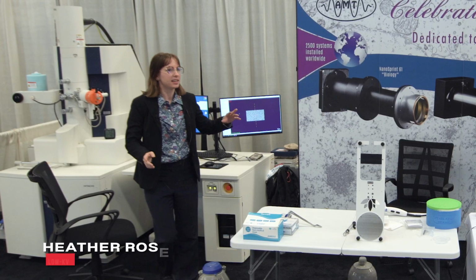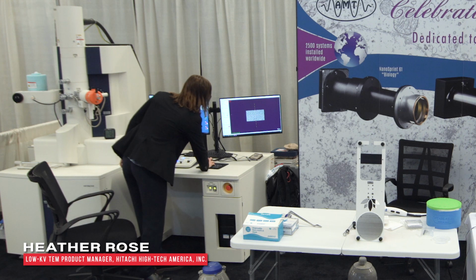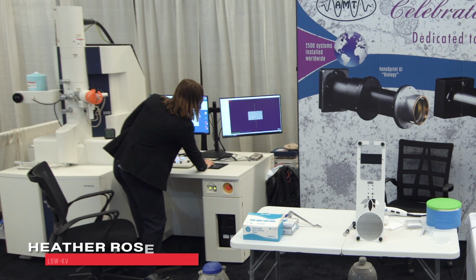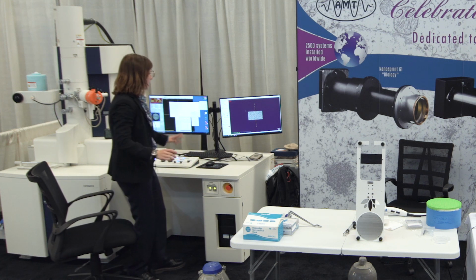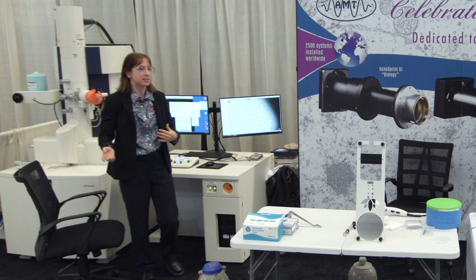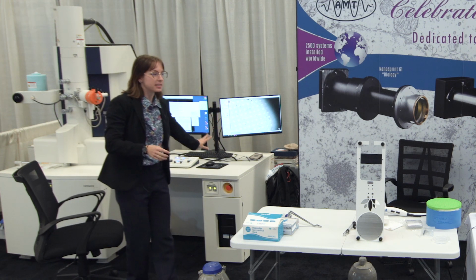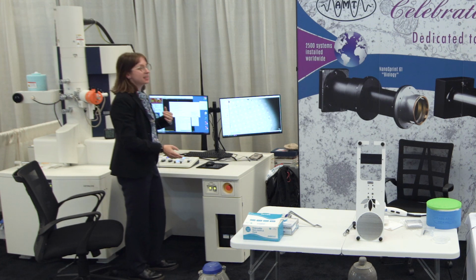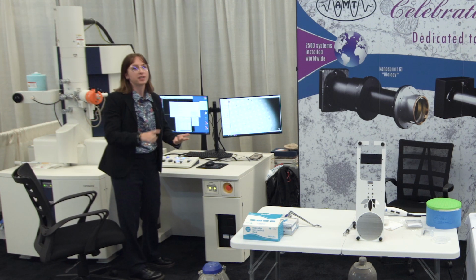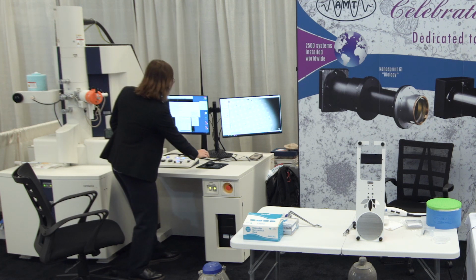I think everyone has seen that, yes, we're collecting the holes. So I'm going to go ahead and stop the collection. And so here we have our SerialEM software, and I'm going through what I was doing and what I was collecting, and why I am looking at these holes, and kind of backing it up just a little bit. Now that we know about all the technology, the camera, the holder, the system, what exactly are we doing here?